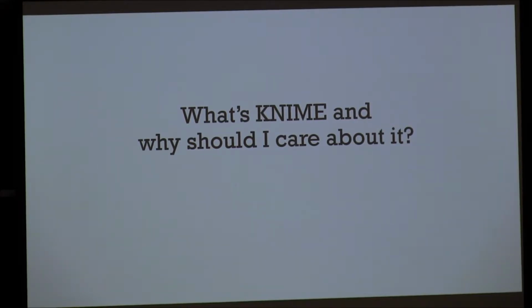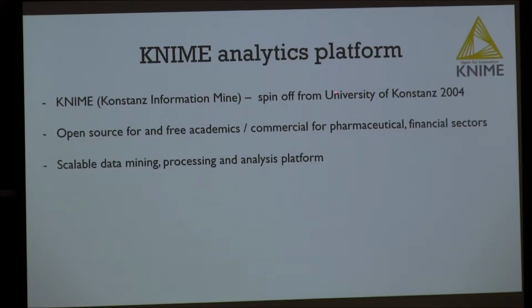No. Okay, that's not unusual because this is coming out of the University of Constance. It came off as a commercial package in the beginning, and the idea is to do data mining for banks and pharmaceutical companies. But then they opened this up to the academic industry, and now it's become quite popular, at least in Europe, for a lot of image processing. So it's open source and free. You can just download this. You don't need to do anything.